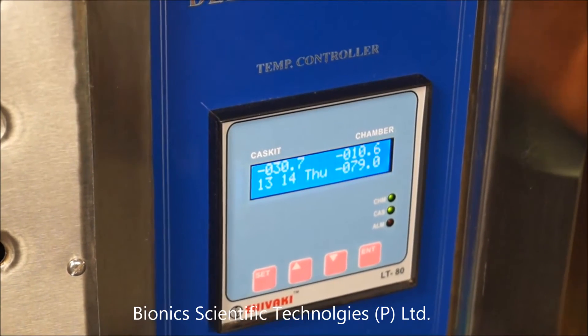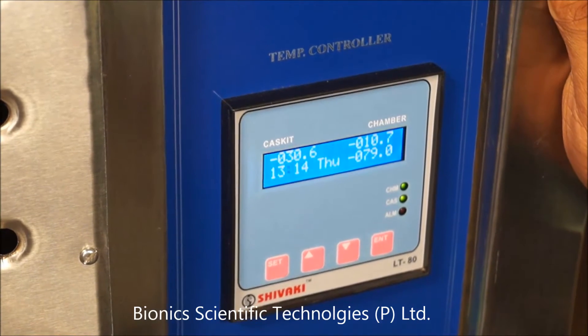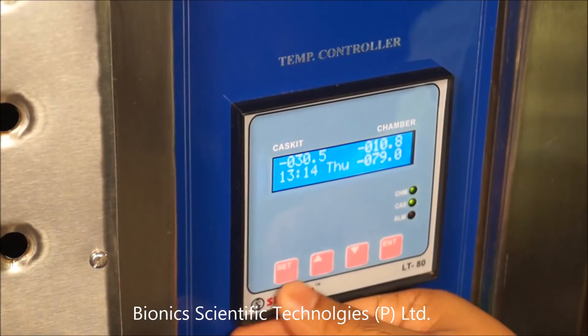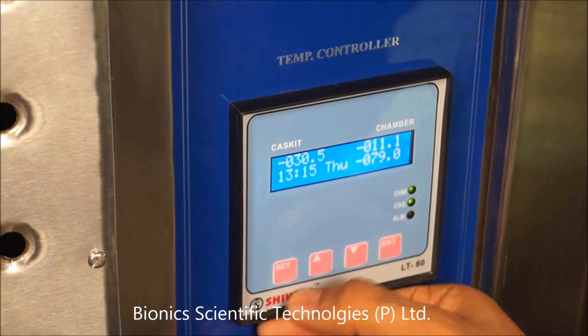Now let's set the temperature of this deep freezer. Here is the set button from where you can set the temperature. You have to press it twice like this.